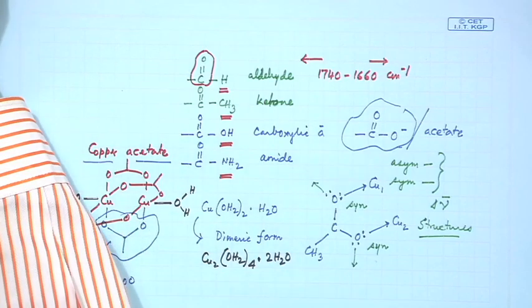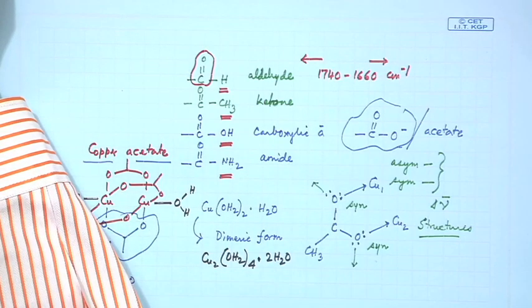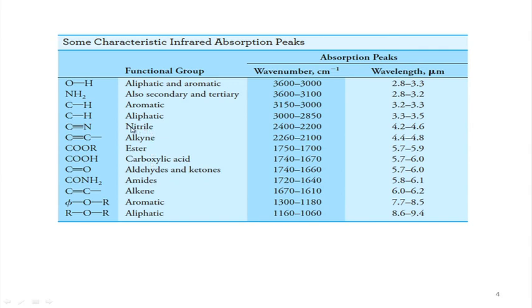So, we get these for not only this copper, but all other very characteristic functional groups of organic molecules, and some of them can be bound to the metal ion center. Just for a simple change, if we go from a double bonded structure to a triple bonded one, what will happen? You see the movement towards the upper range, that means towards 2260 to 2100 centimeter inverse when you go for the triple bonded one.